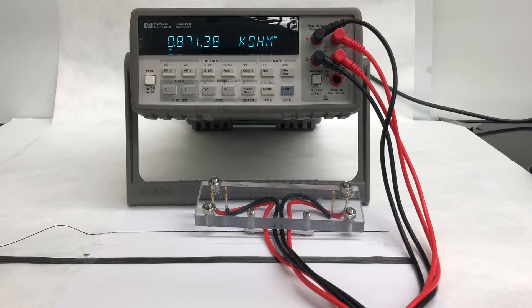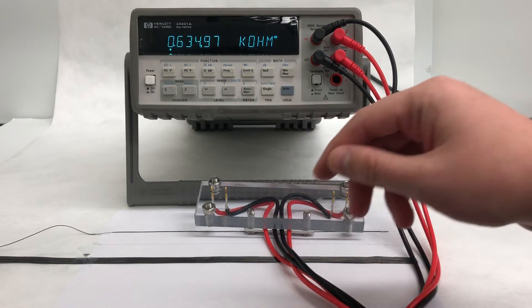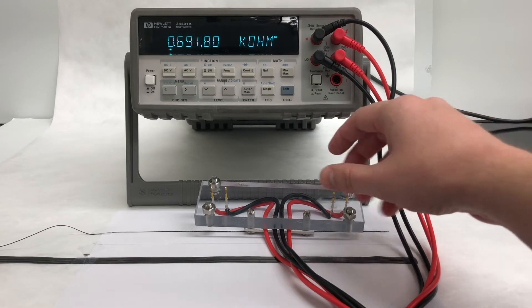The measurement uses a digital multimeter, such as the one I'm using here, and what's known as a four-point probe.